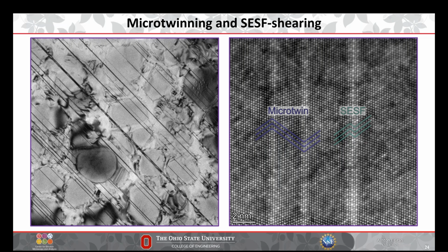Okay. Which SEM model did you apply the ECCI analysis with? Yeah, so this is the Apreo-based system. Dan Vecti probably knows all of the more niche details about the specific setup. But essentially, it's just the Apreo-based system with the Trinity column, and I use an electrostatic lens basically to improve my resolution for this.